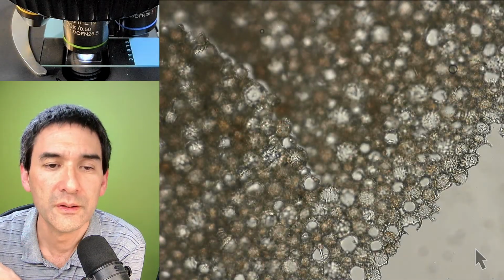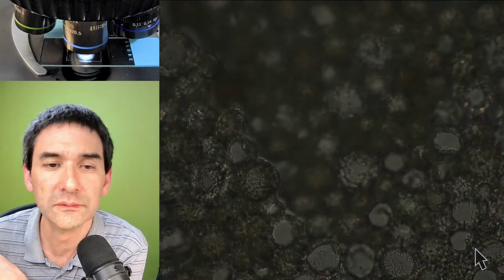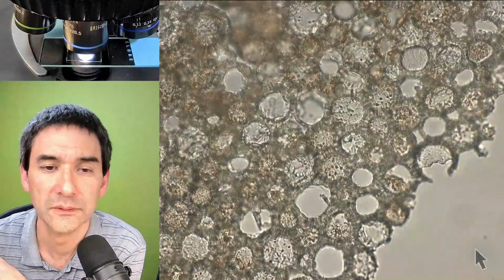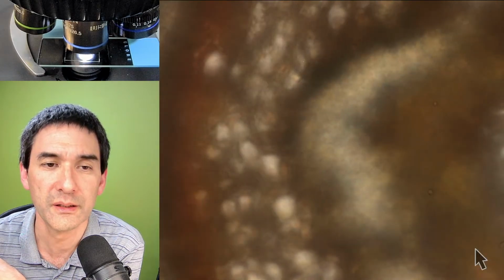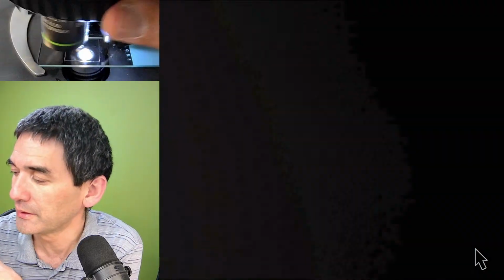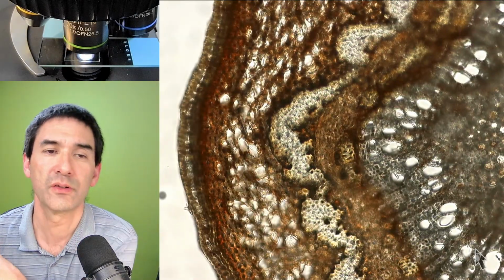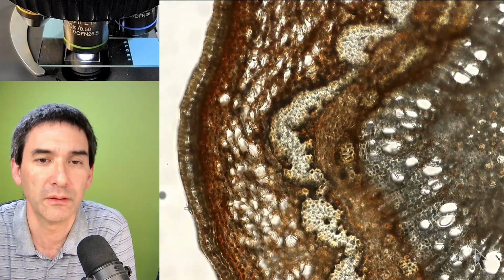So we're able to see the individual cells here. And here it's a little bit thicker. Let's go down. It's all non-stained, right? So I think you get the idea, and I think it looks nice.